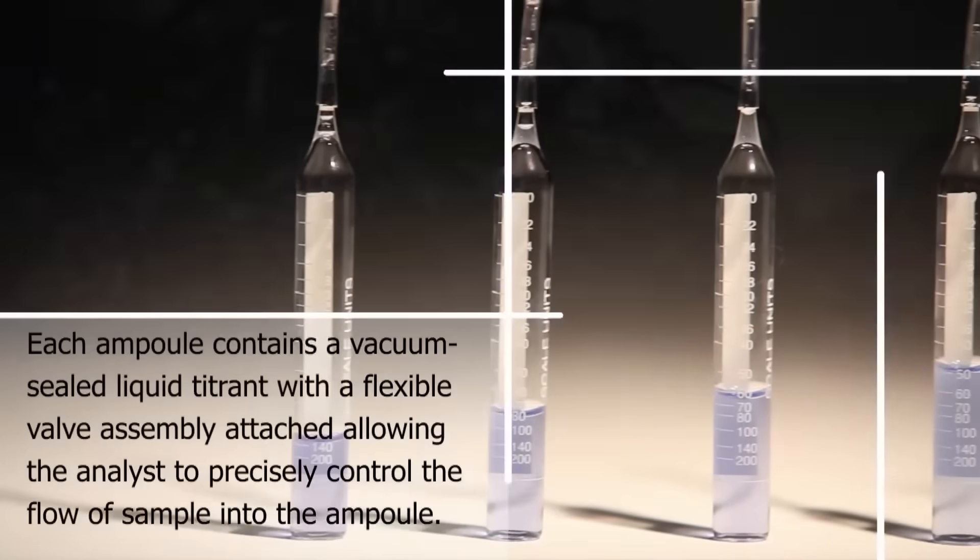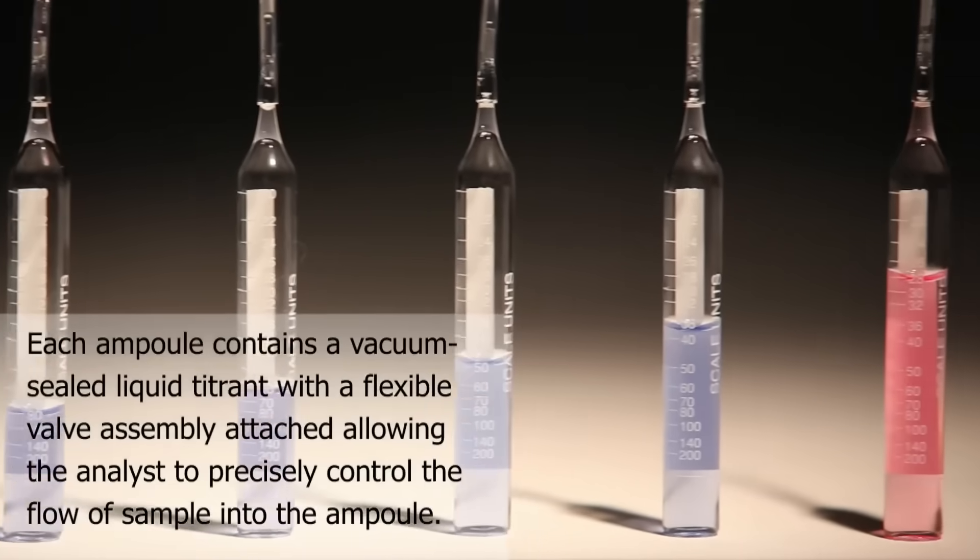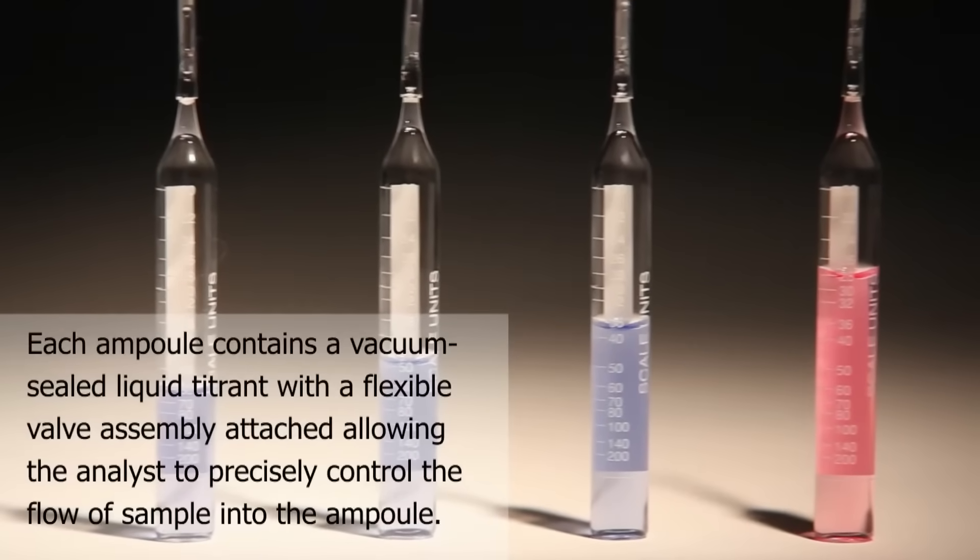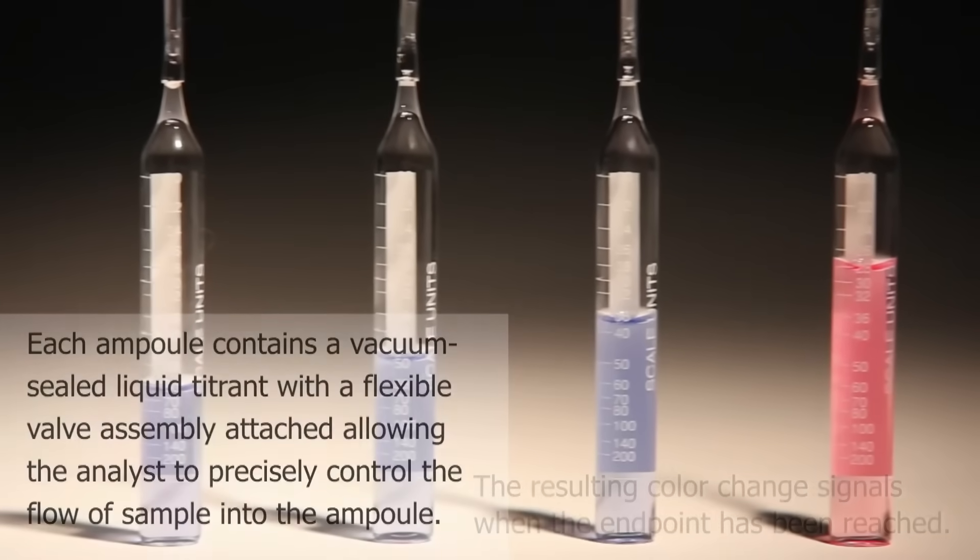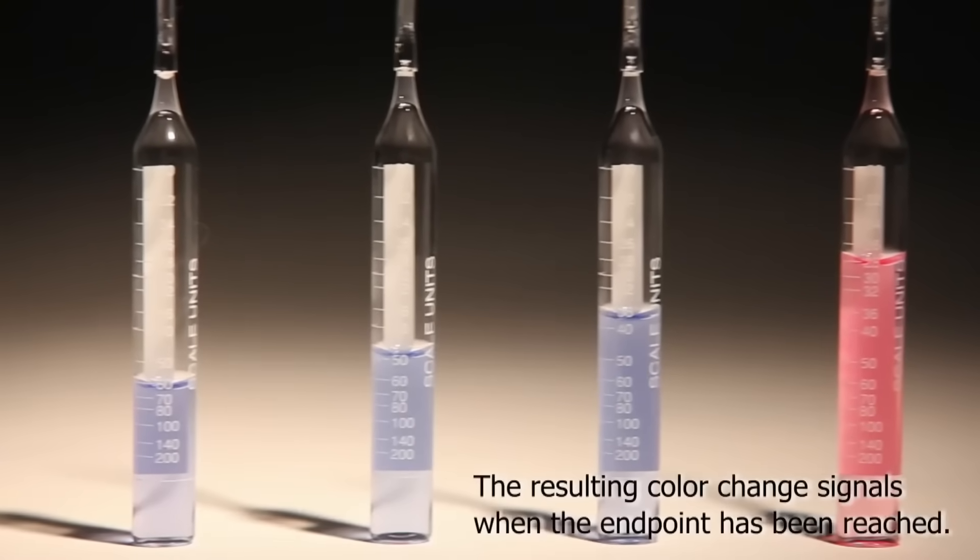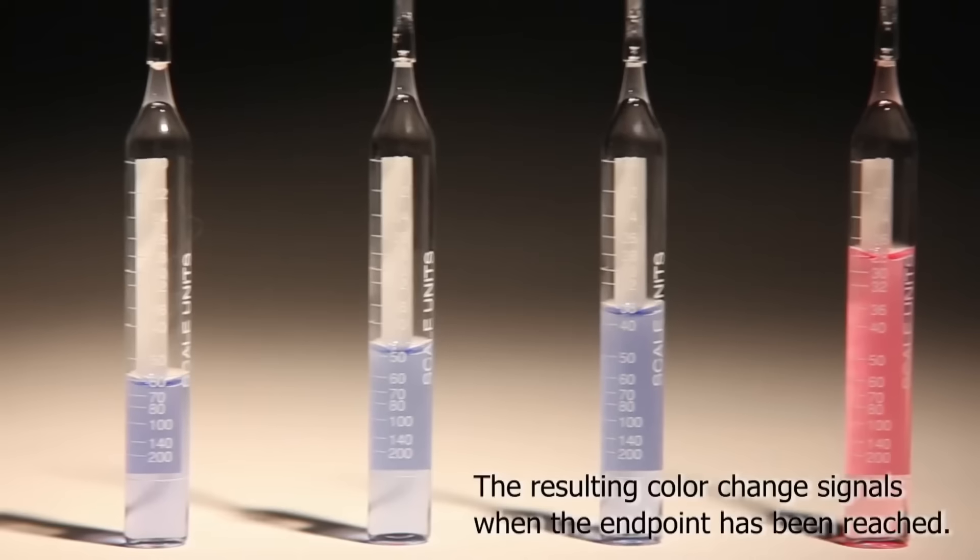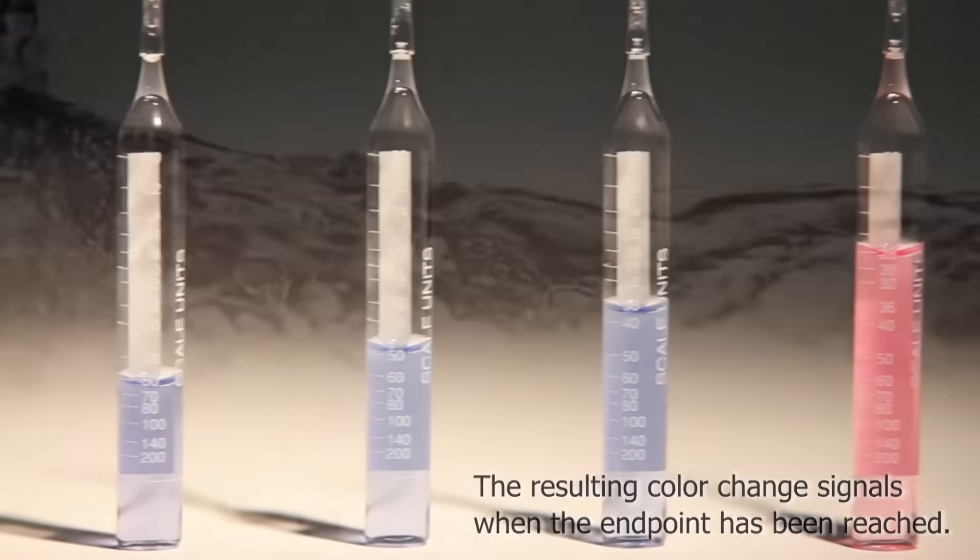Each ampoule contains a vacuum-sealed liquid titrant with a flexible valve assembly attached, allowing the analyst to precisely control the flow of sample into the ampoule. The resulting color change signals when the endpoint has been reached. For purposes of this video, we will be illustrating the total hardness test procedure.